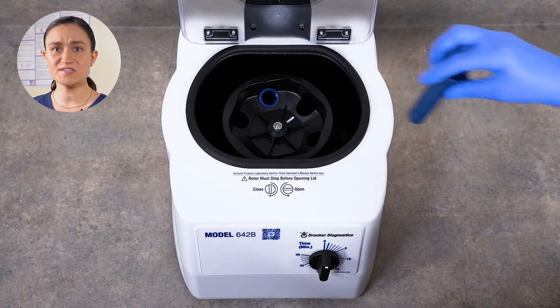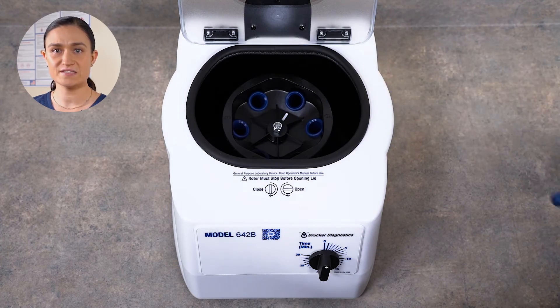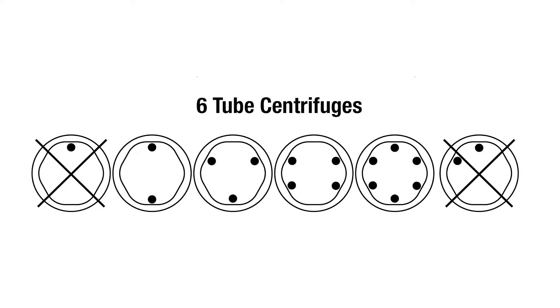Now let's look at how to load your 642B and spin your first samples. Part 4: Spinning Samples. When loading the 642B, or any centrifuge, it is important to make sure you load the samples in a way that keeps the rotor balanced. Loading balanced samples helps keep the lab safe and ensures the maximum lifespan for your centrifuge. Step 1: make sure that all 6 tube holders are properly seated in the 642B rotor. They do not snap into place, but should be seated one per slot in the rotor. Step 2: load your samples. When loading your samples, opposing tube holders must be of equal weight, as shown in the diagram on your screen.